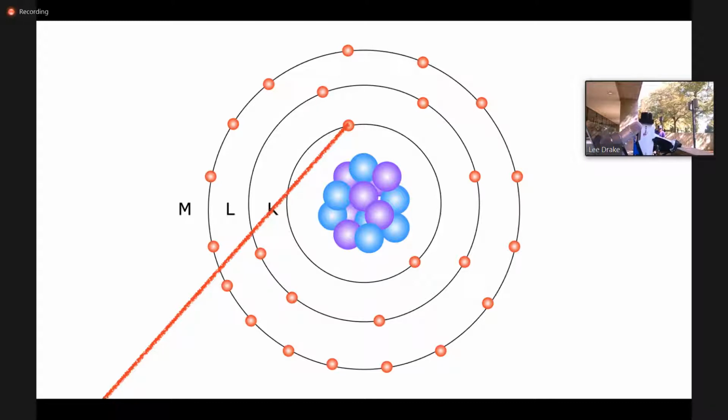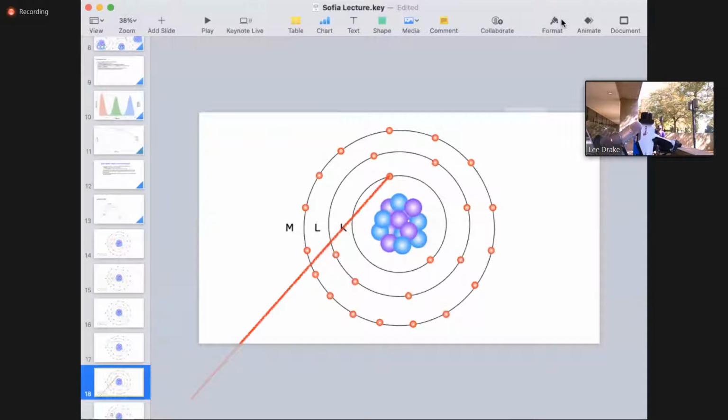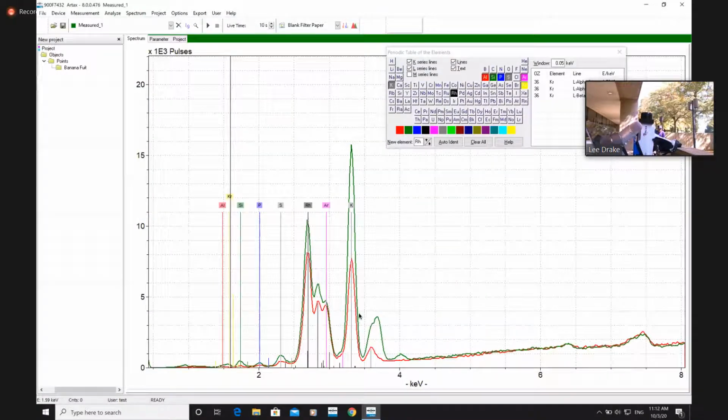So when we go back to our spectrum, there we are. When we see our spectrum here, we're seeing the total sum of atoms of potassium detected. So the way to interpret this qualitatively, by the way, this gets a lot more complicated when we get into the depth of statistics, but to keep it very superficial at this point, we're measuring more atoms of potassium in the peel. So in this case, the peel is actually much more nutritious than the fruit.